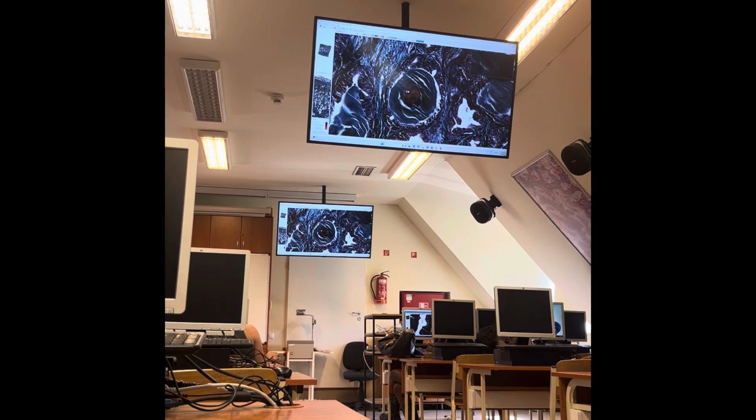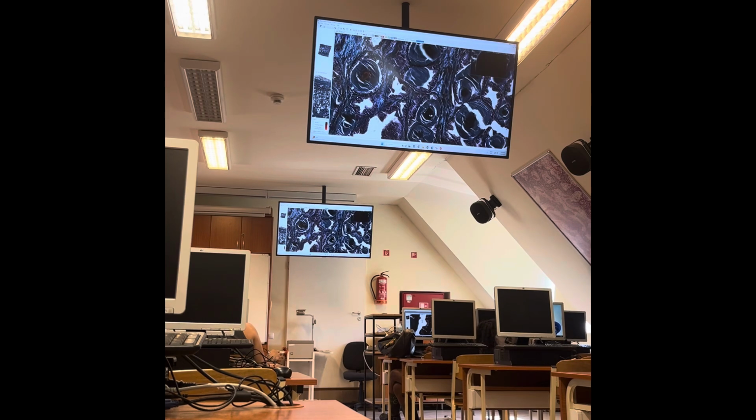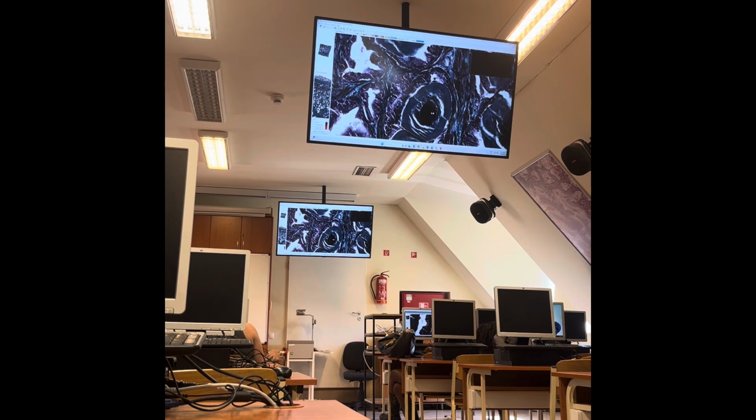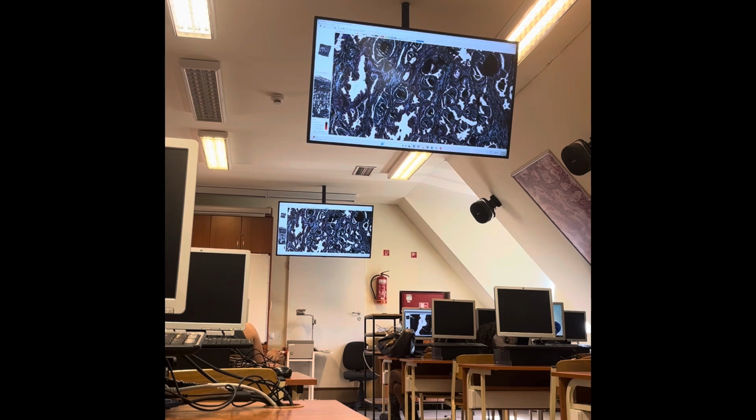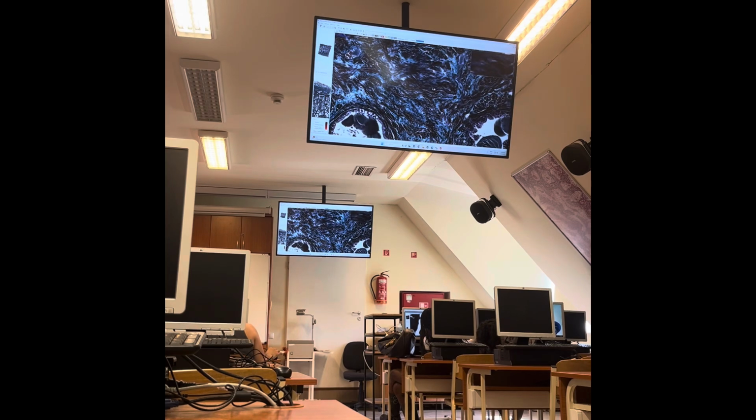The peripheral part contains mostly organic components, that is this bluish-greenish color, and the centrally calcified portion changes its color to more reddish or at least darker coloration, like in this example of the concretion. Okay, so that is the next specimen, yes?